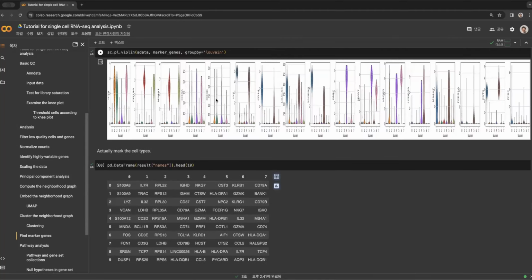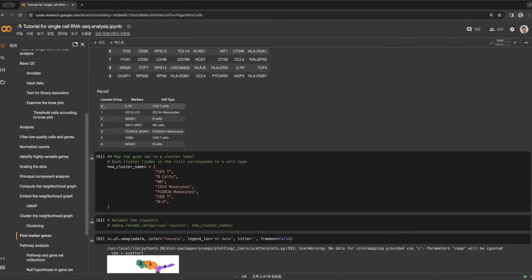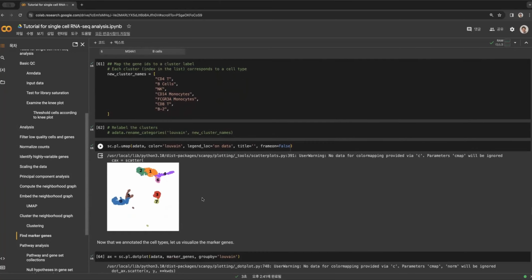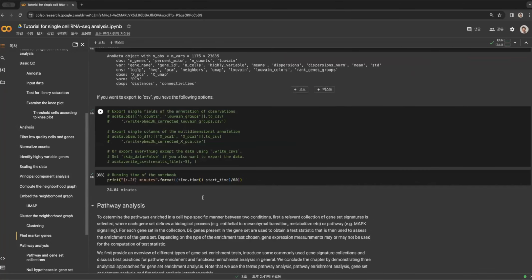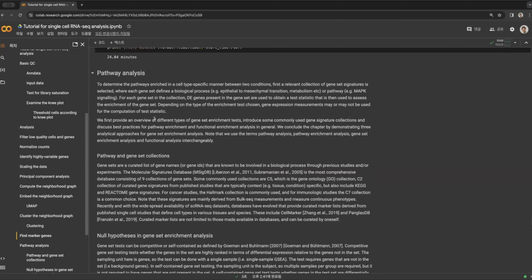So let's assume that we have here, sorry, Rank genes group 0 is explained by IL-7R, so we assume that cluster 0 is the CD4 T cells. So we are expecting there must be CD4 T cell pathways highly expressed in cluster 0, right? So likewise, we can think about these pathways within each cluster, right? So how can we do pathway analysis in your single cell data set?